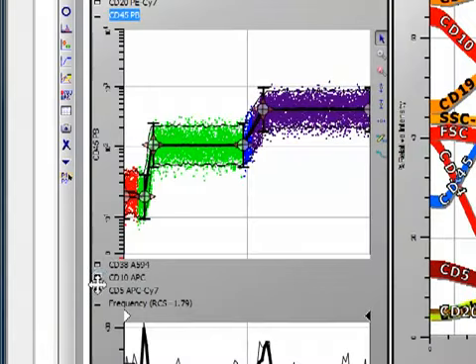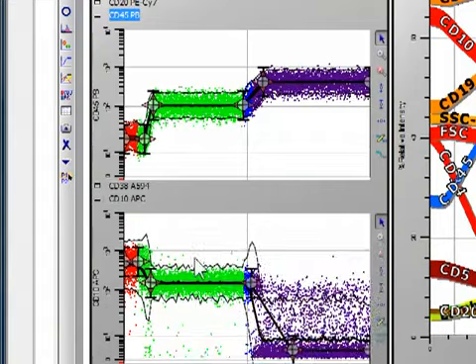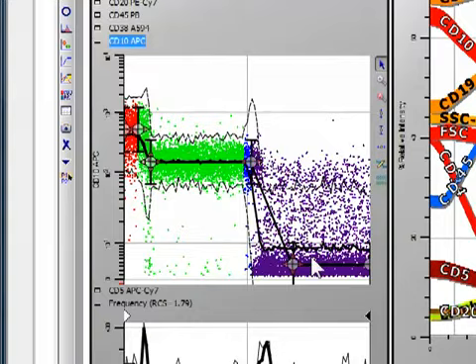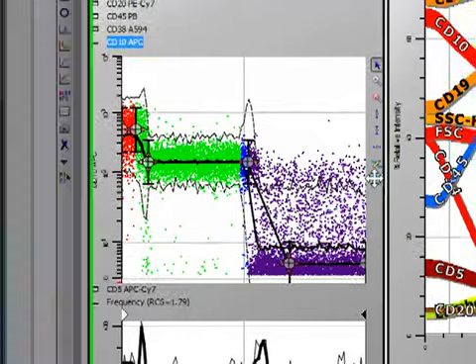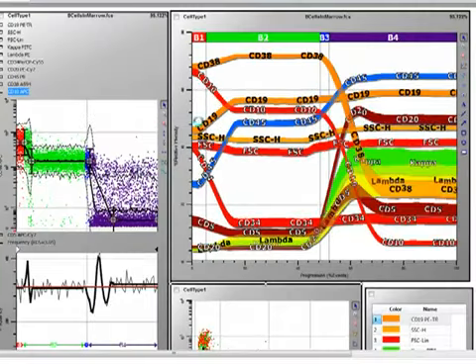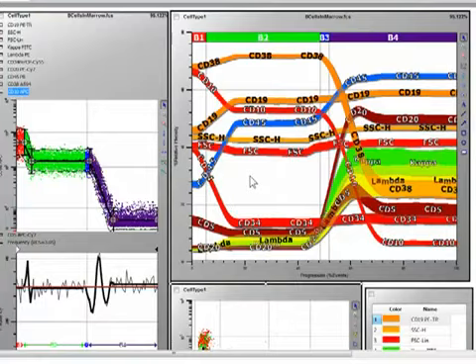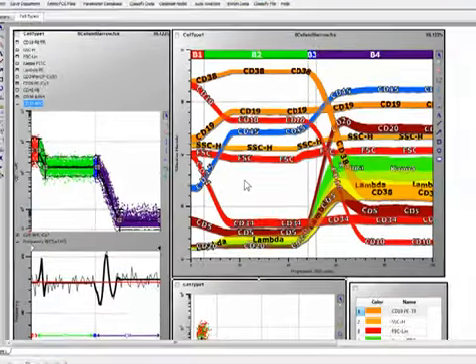The last one we'll show you is that he probably did CD10 next, and again, as you can see, it obviously is in 3 levels here, and then when he modeled that, the system got even better. Well, Sam looks like he's done a pretty good job on this, Bruce. Well, he should have, since he received our 2-day workshop and learned how to do this modeling. That sounds like a good idea. It is. It's an intense time, but it's the great state of Maine, and you'll learn all about how to do this modeling.